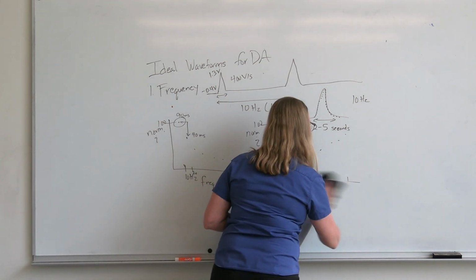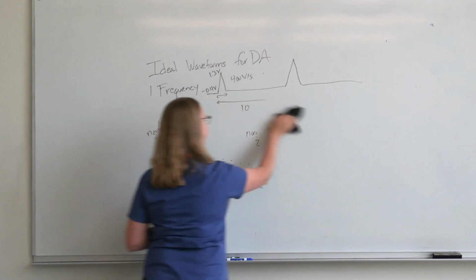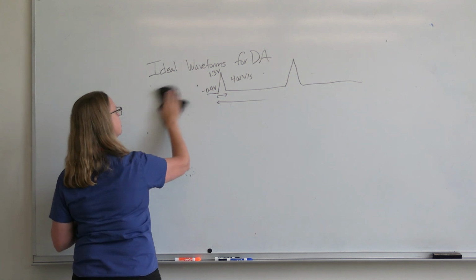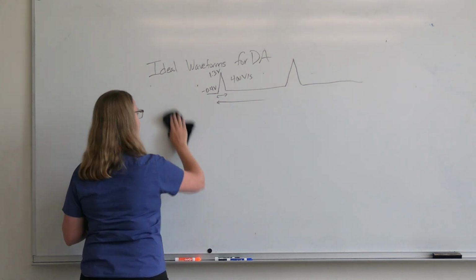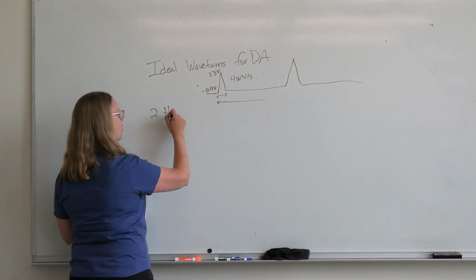Okay, so that's the frequency. Let's look at the next parameter. We'll look at holding potential.